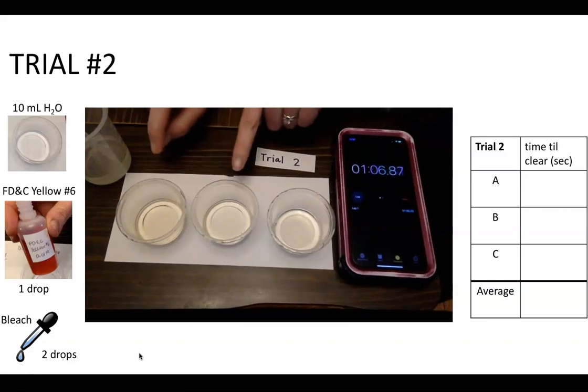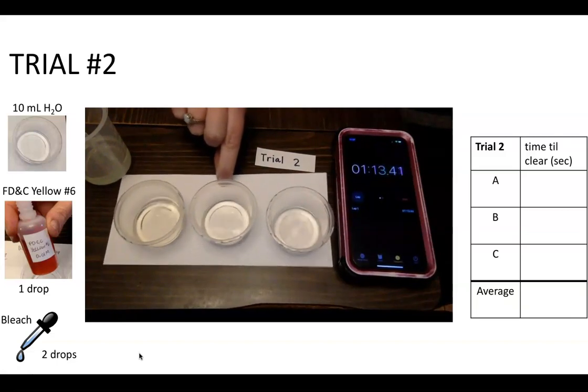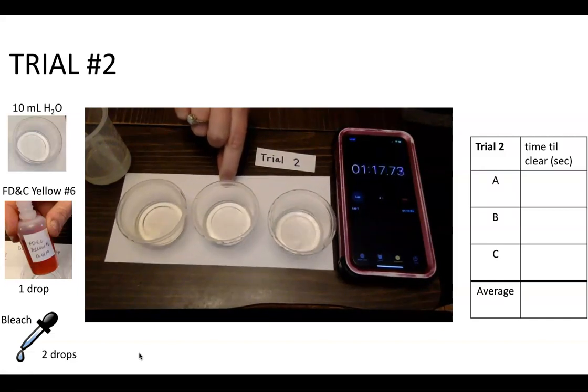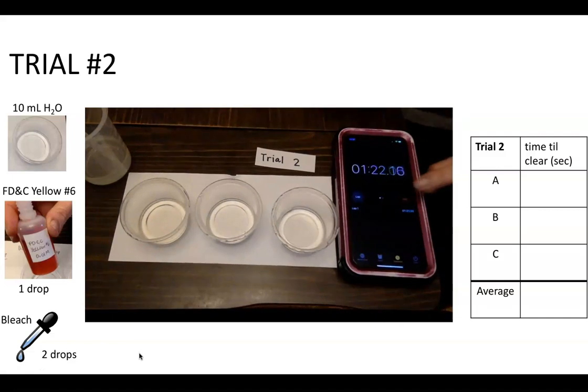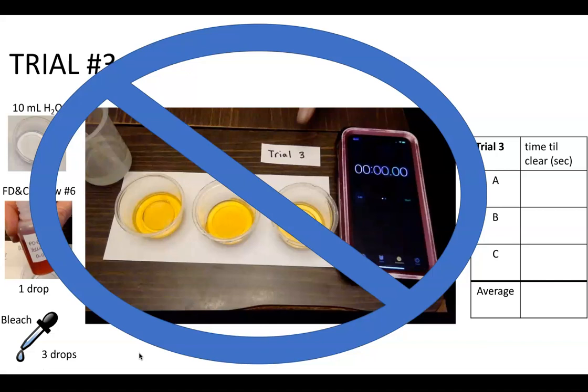There's 1, there's 2, and there's 3, I called it. Here's trial 3 that I said we're not going to do this one.